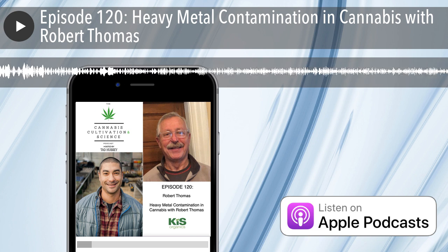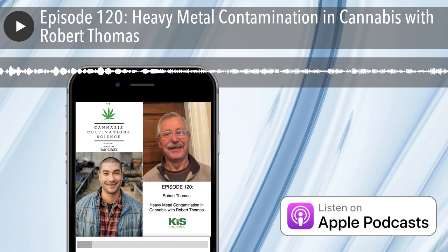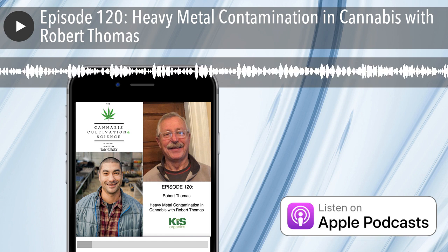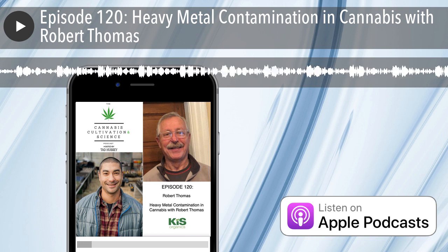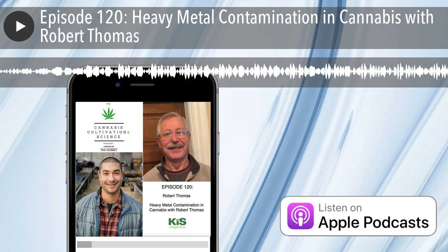And my first big project was a tutorial series on ICP-MS. ICP-MS is the most widely used trace element technique in the cannabis industry. And it's a technique that I've been working in for the past 40 years, having actually cut my teeth on the first commercial ICP-MS ever built in 1983.